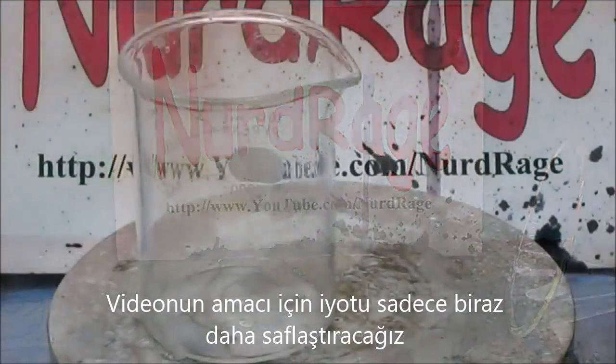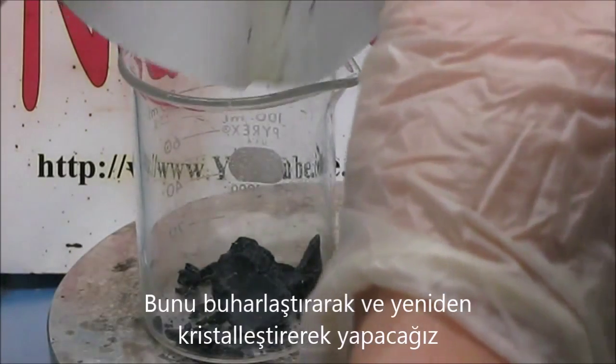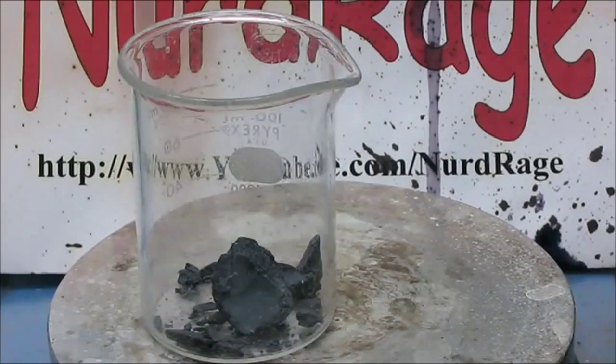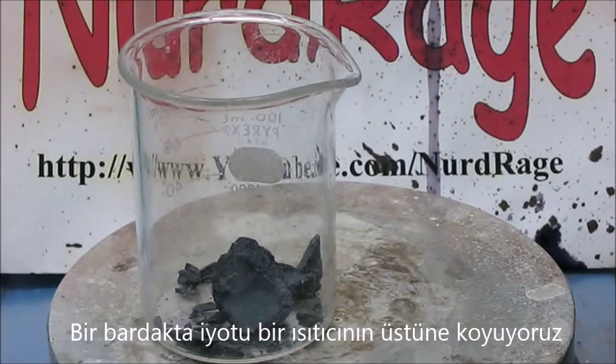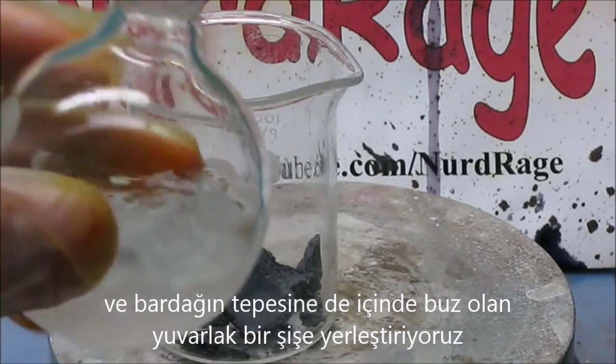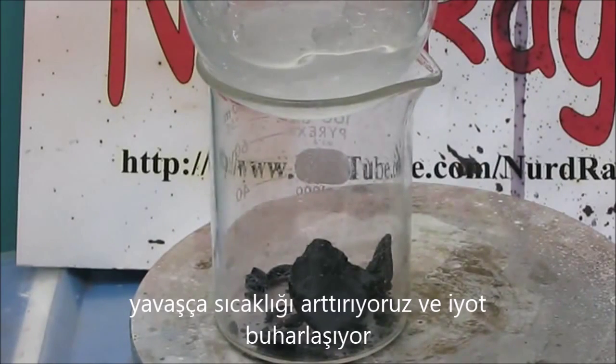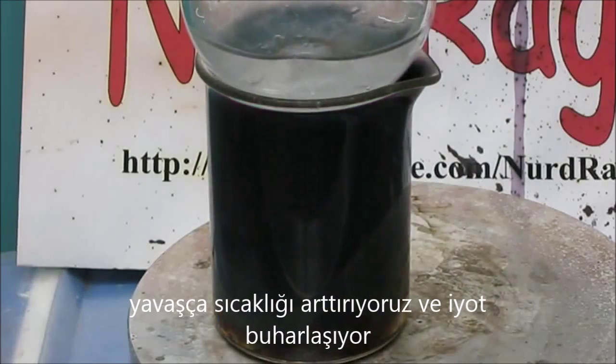For completeness of this video, we're going to purify the iodine just a little more by vaporizing it and recrystallizing it. So on a heater, we place the iodine in a beaker, and on top of the beaker, we place a round bottom flask that has some ice in it. Simply turn on the heat and let the iodine vaporize.